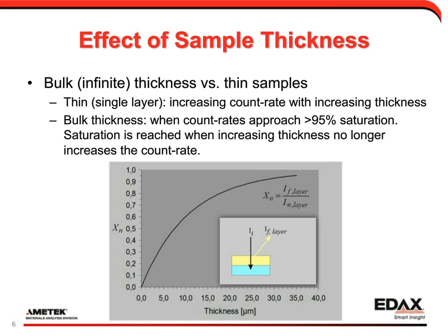Typically with traditional XRF quantitative routines, as I mentioned, you have mainly fundamental parameters, which assumes that the sample is bulk thickness. But since we have samples which are not actually bulk thickness, their intensities will vary, and based on the variations in intensities, using fundamental parameters is obviously not the most appropriate routine to use, because the quantitative routines will not reflect the influence of the sample thickness.